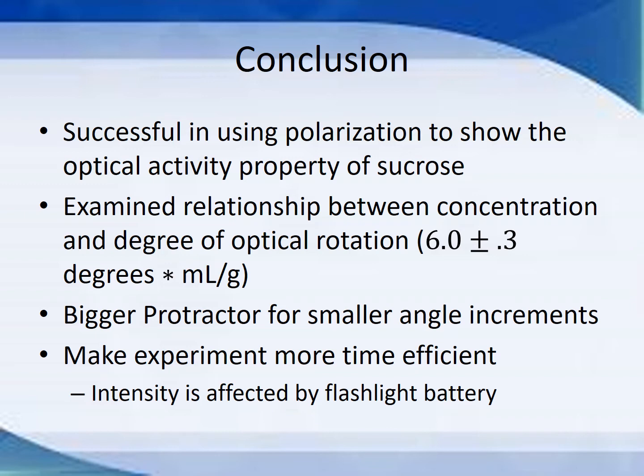It took us about 6 hours to collect our data, and so while we didn't really notice any decreases in intensity of the flashlight, it very well could have happened that the intensity could have decreased a little bit over that time due to the depleting flashlight battery.